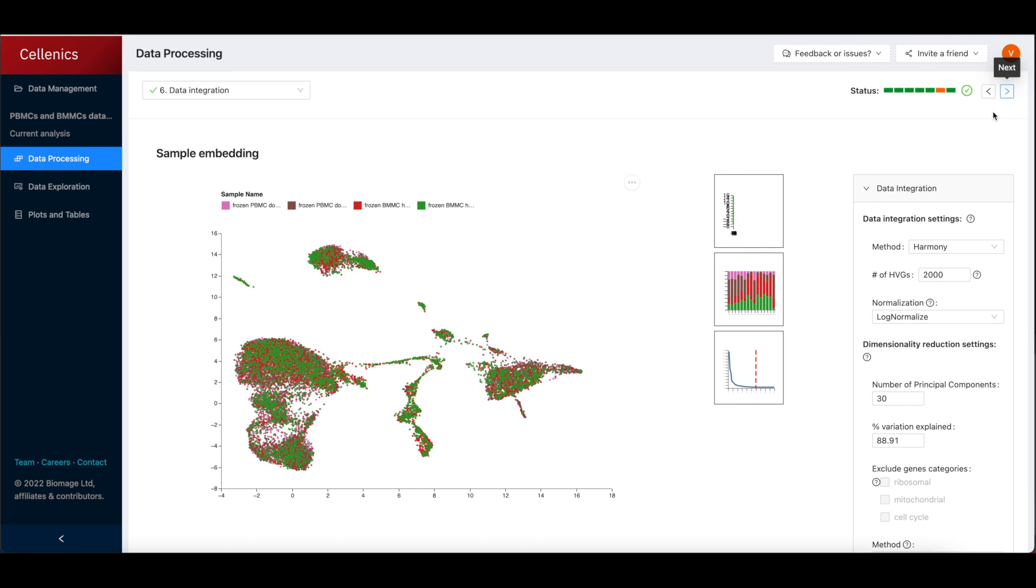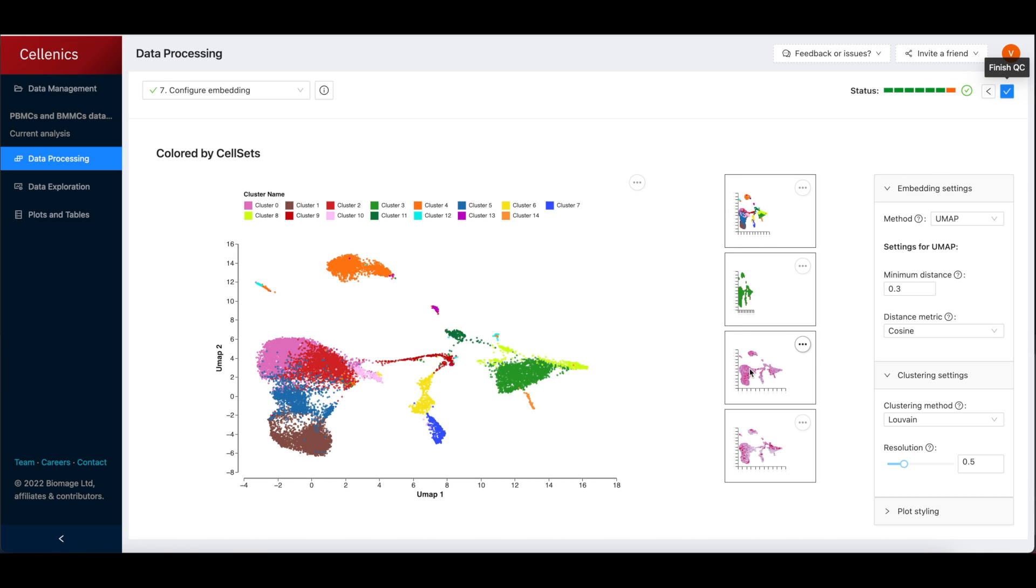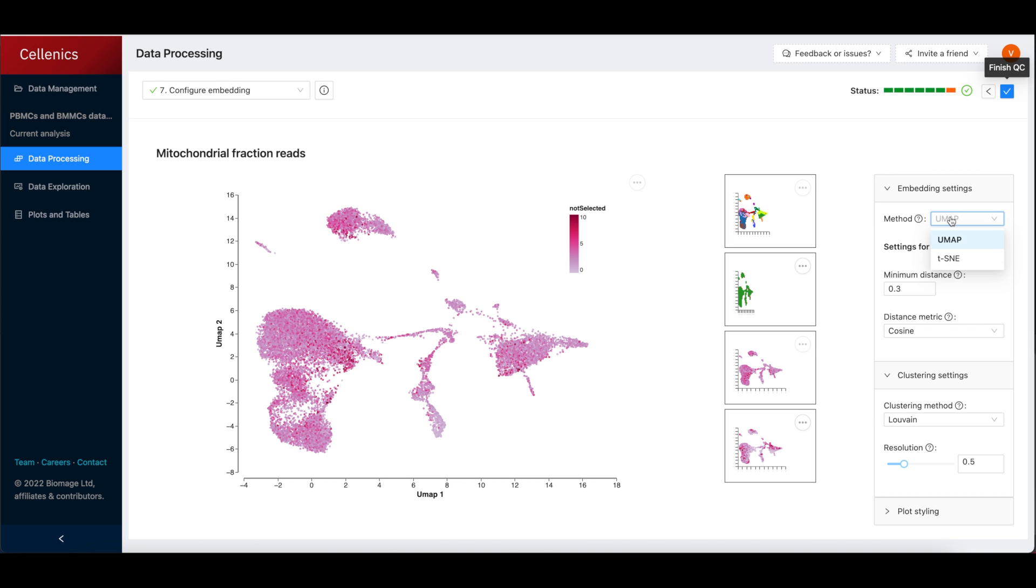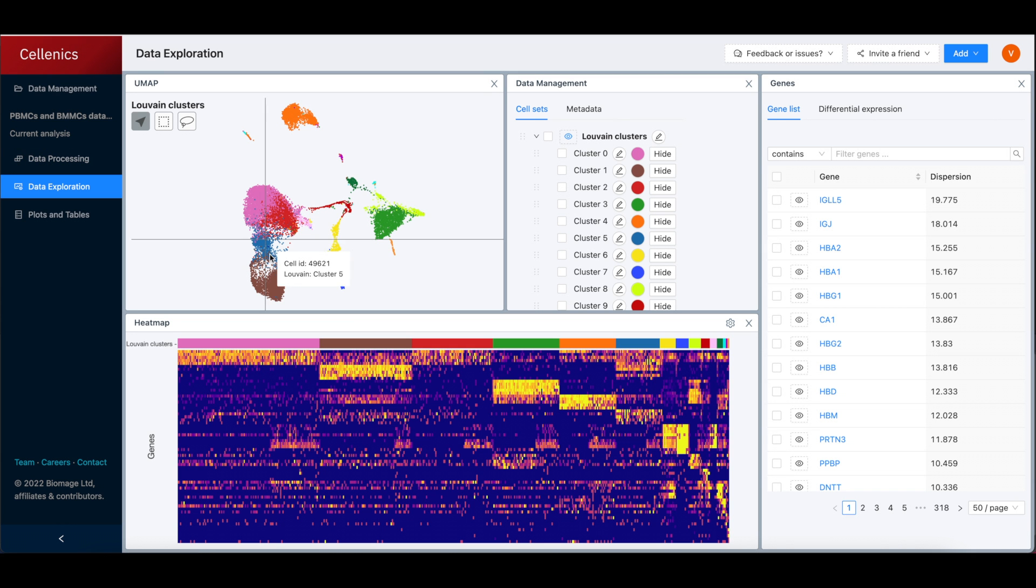Multiple sample integration is also controlled here, with various options for controlling batch effect and normalization.